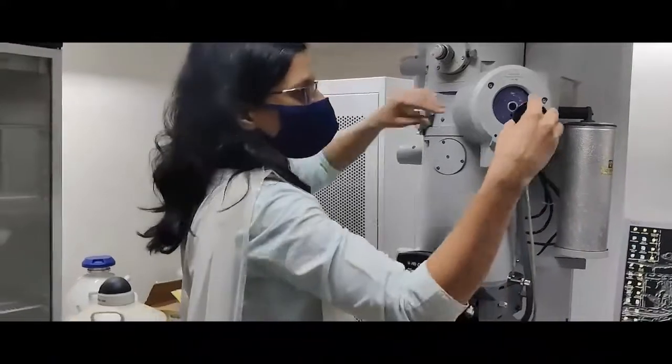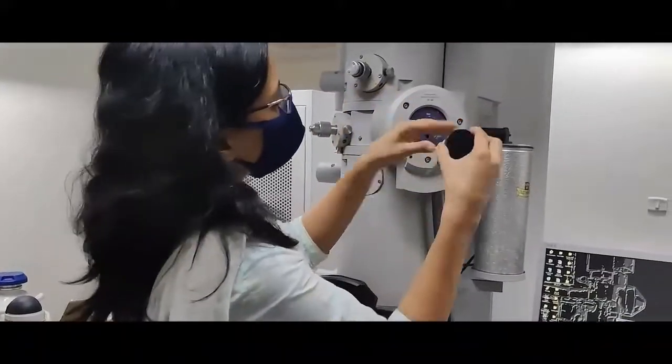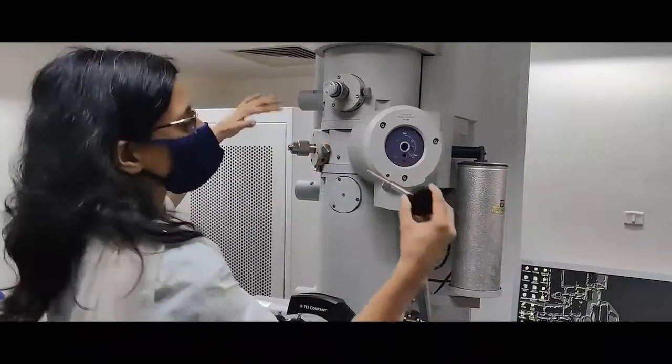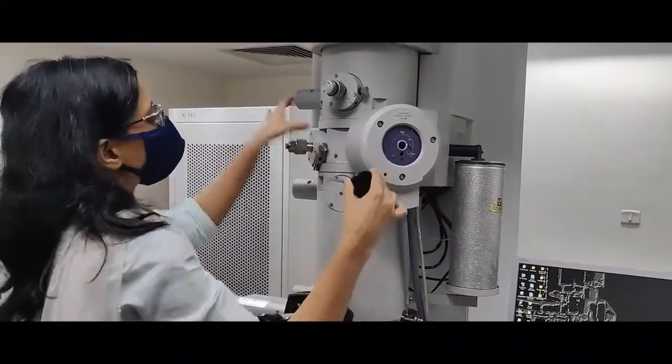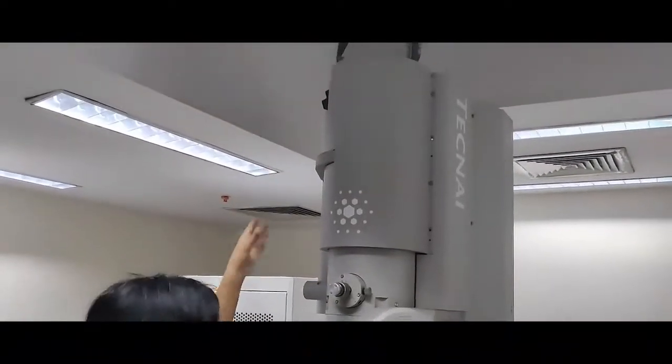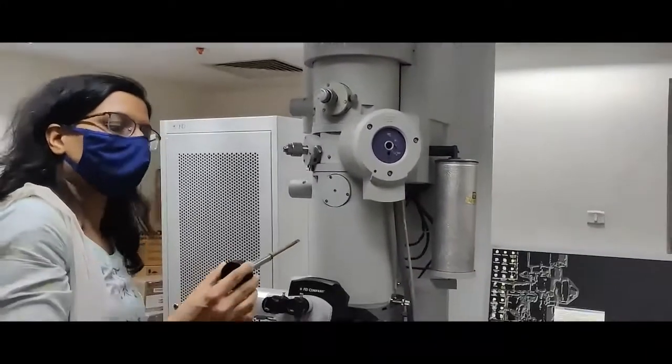You will do this. And, what you can actually see after inserting it, is just this. The entire rod goes inside. So basically, it goes somewhere in the middle of this. And, this is the long tube that you see, is the path of the electrons.